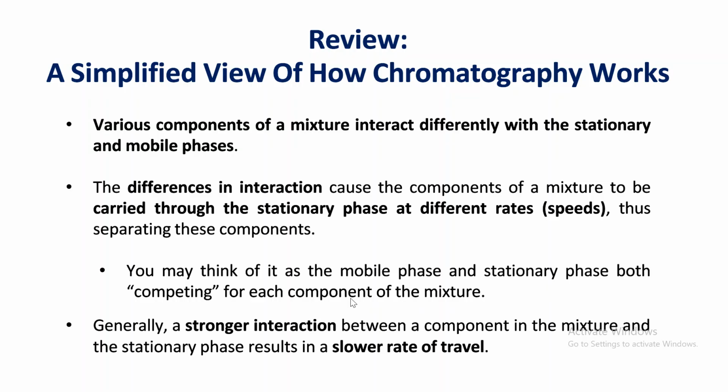If the stationary phase wins, the molecule is going to be traveling very slow, and if the mobile phase wins, the molecule is going to be traveling at a much higher speed. It'll try to match the speed of the liquid going up the stationary phase.